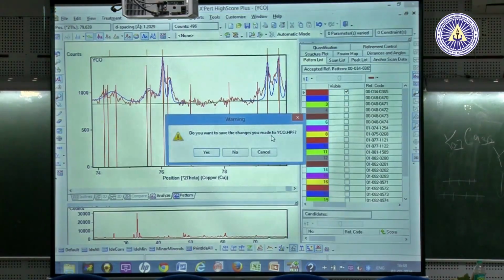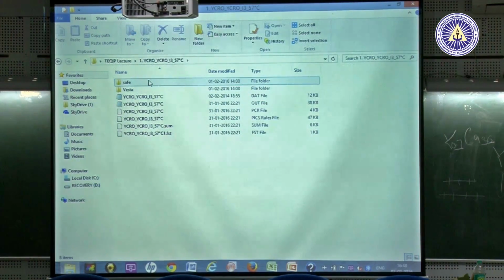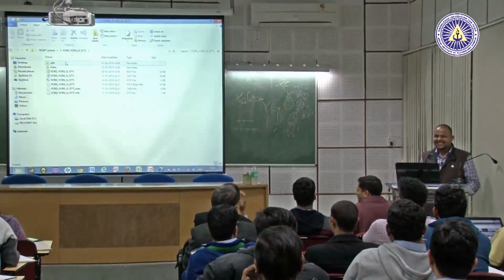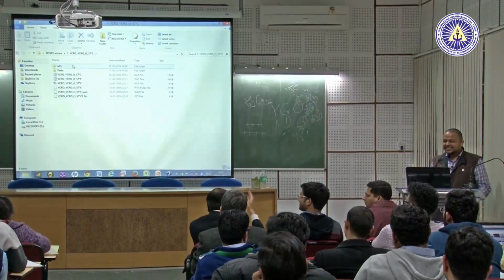If you are okay from here, then I will go for refinement. Yes sir? Okay means what, sir? Okay from here. Okay means it has come out. No, you see a good match, so you know that this is the structure. Now I have to refine this.